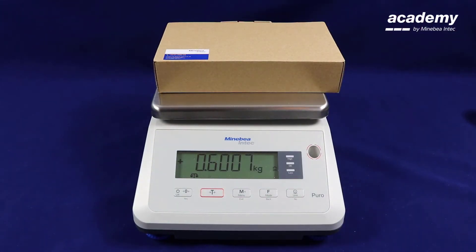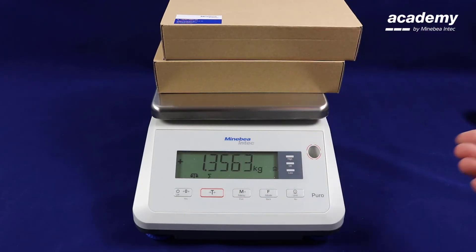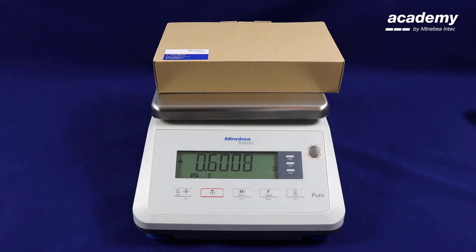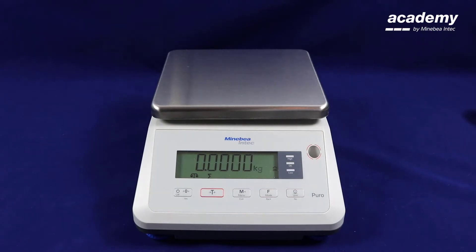It is not possible to add more than one sample onto the weighing pan. The second value will not be stored. When you add new samples, the weigh pan must be completely empty.